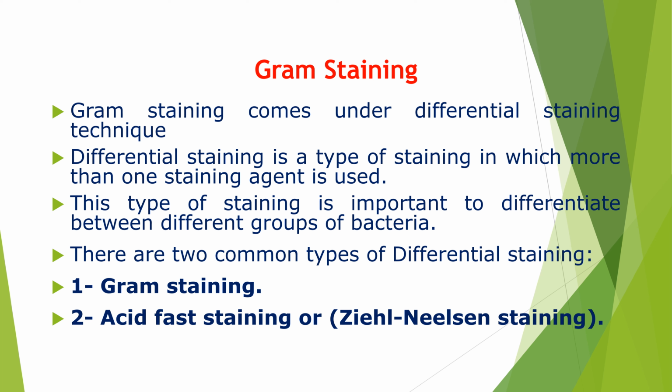Gram staining comes under the differential staining technique, and differential staining is a type of staining in which more than one stain is used. This type of staining is very important for bacteria. Then what is the importance of doing gram staining?